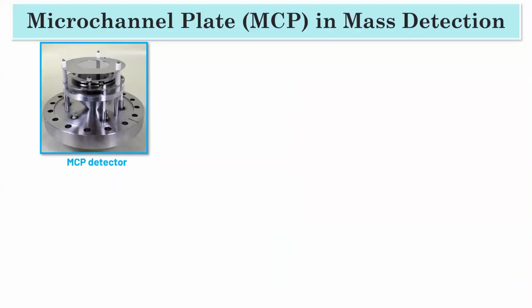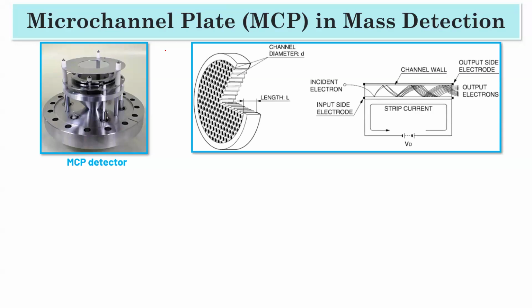Okay, so there is another one, the microchannel plate detector. It is a similar concept, but instead of having just one channel, you have a lot of channels, and in each of those channels you have this dynode type of structure. In each channel, a lot of electrons will be generated, so you are going to get more signal, because the amplification of the signal will be very large.